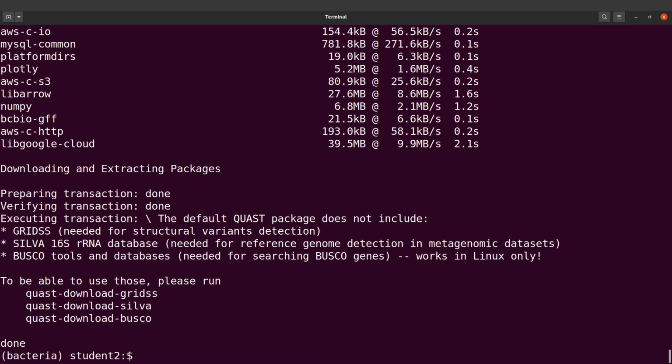All right, now all the tools have been installed except one, but we will install that later on. So for now, let's clear the screen and continue. I repeat, there's one more tool that we install, but we will do that later on in the tutorial. So let's continue.